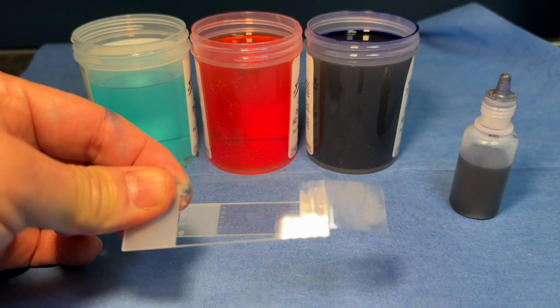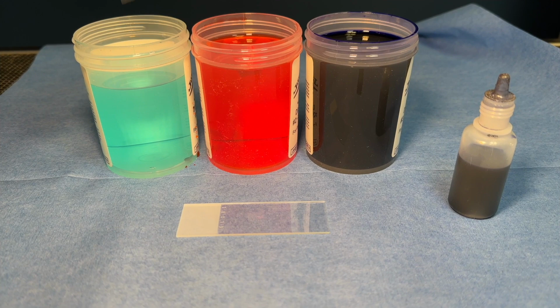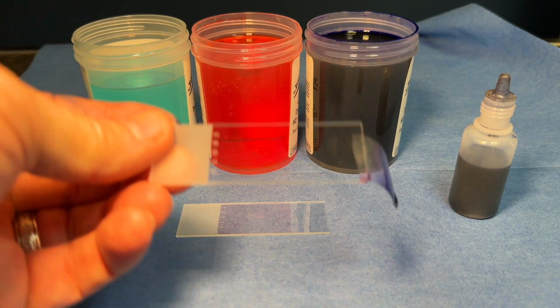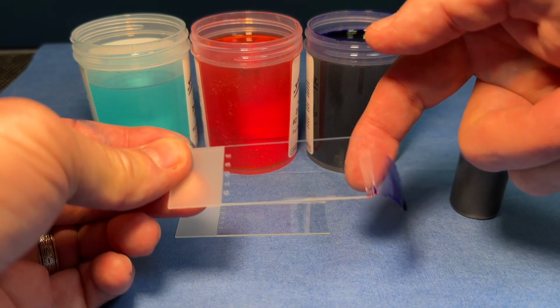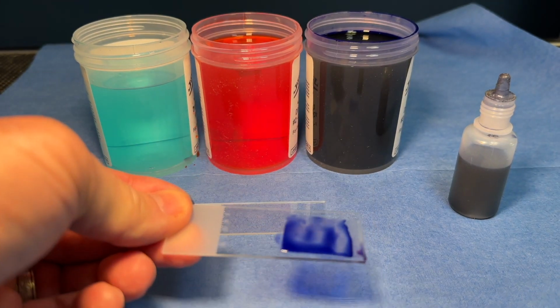Many people will dangle the tape off the edge of the slide and then go through the customary 6 to 10 dips per each stain. One of the problems with this is that it's very messy and labor intensive. Also, the very first stain is an alcohol fixative, which can dissolve the adhesive on the tape, making it fall off the slide. The tape can be flipped over and adhered to the slide.